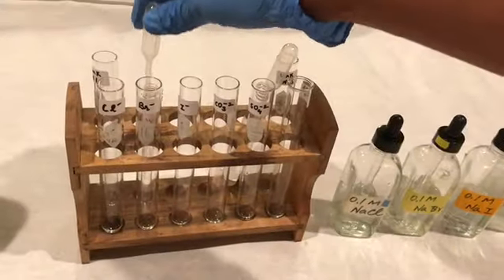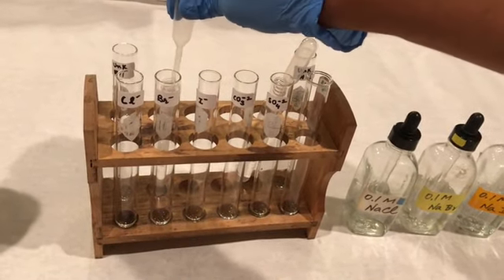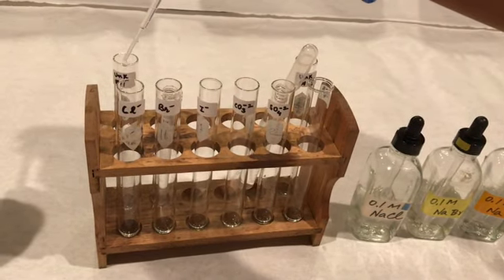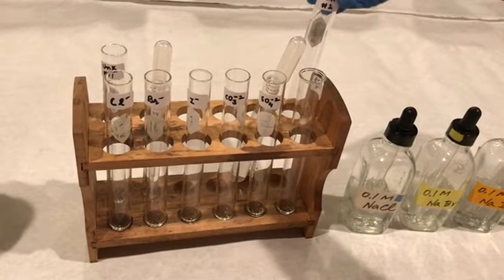Now I'm going to add unknown number 1 from the reservoir unknown tube, and this is the unknown number 2 tube.